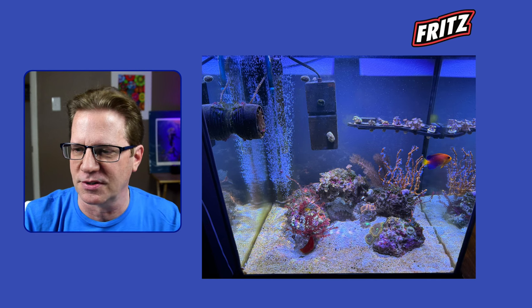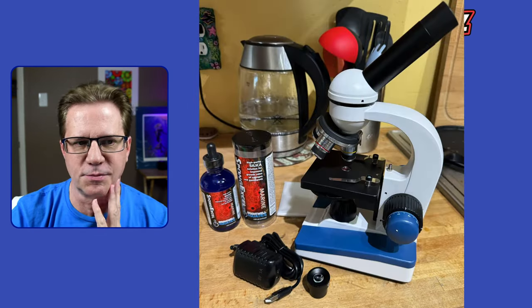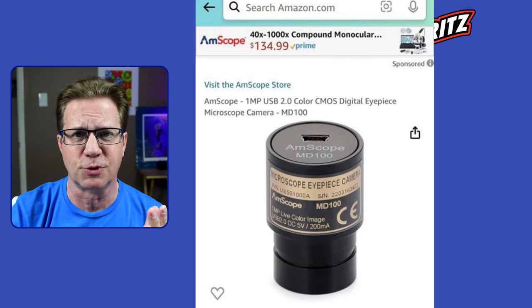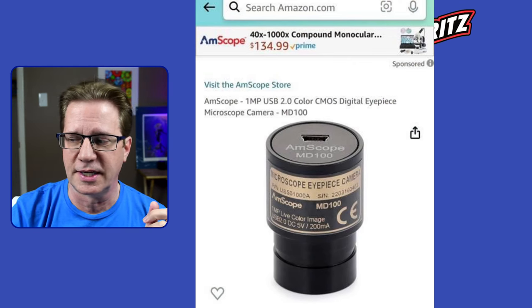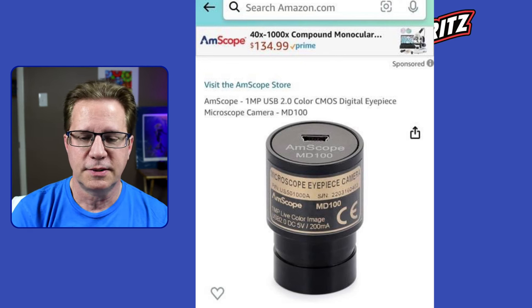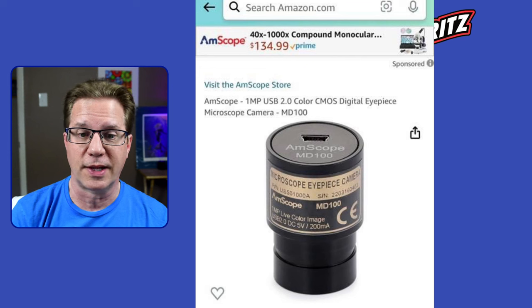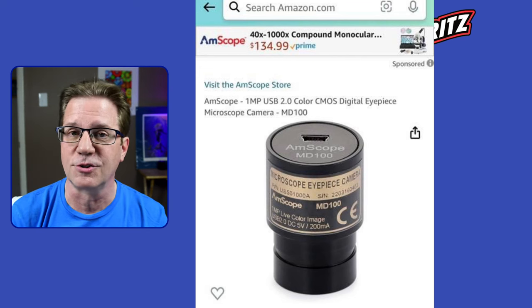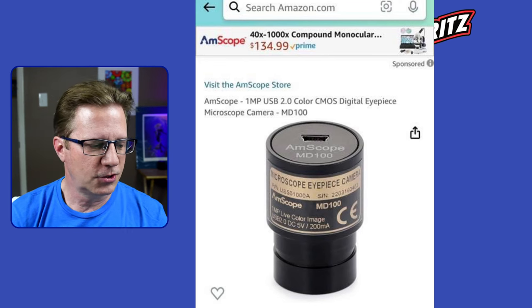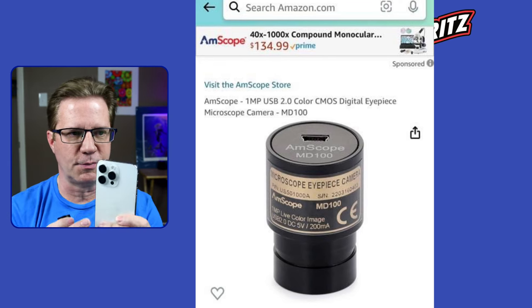I showed you this microscope. There is an attachment that works for Windows desktops and maybe Android phones where you can put a piece in the top of the eyepiece and tether it with a wire to a laptop. It's very hard to line up your phone camera with the eyepiece.